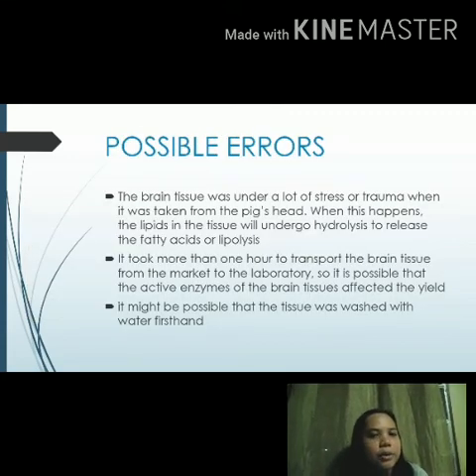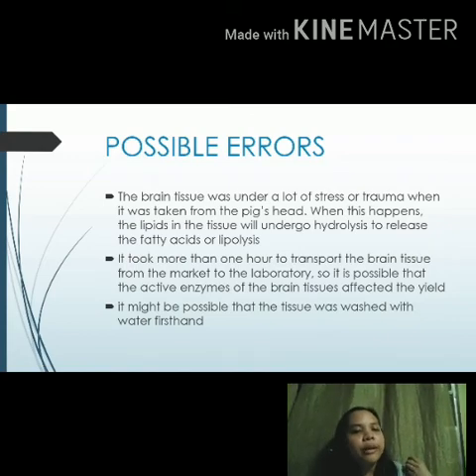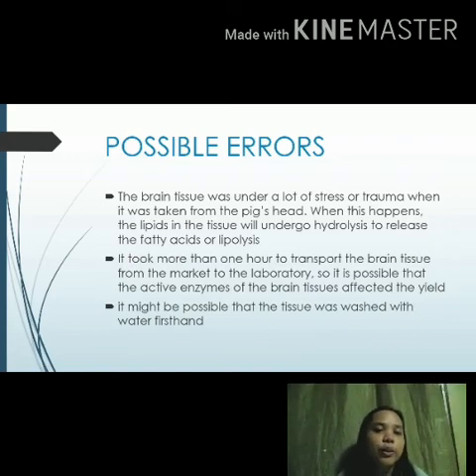The possible factors that could have affected this yield is, first, we didn't know how the tissue was gotten out of the body of the pig.